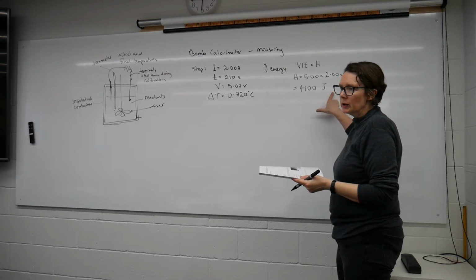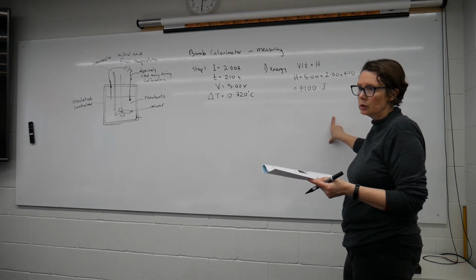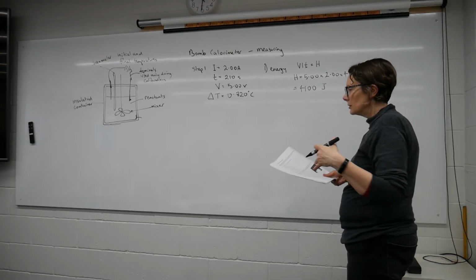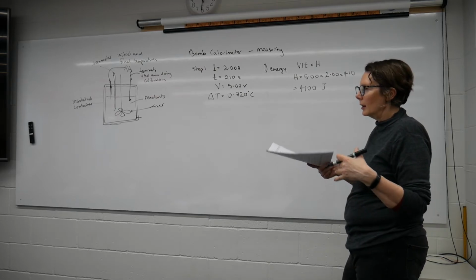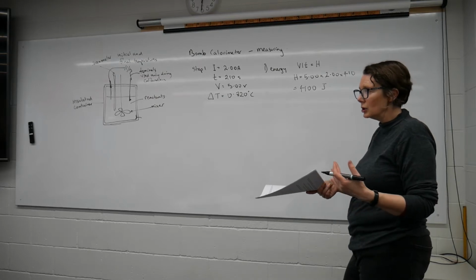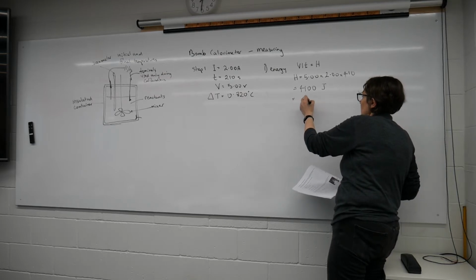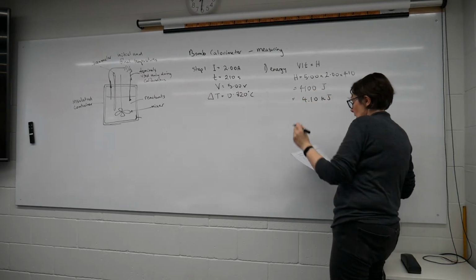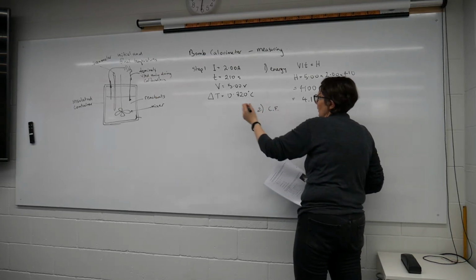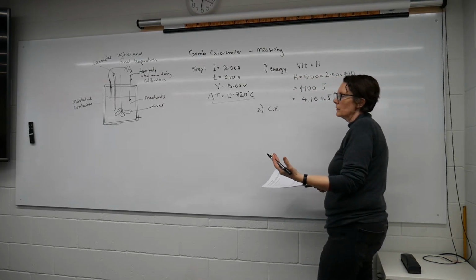The SI unit for energy is joules, but we calculate mostly in kilojoules. So what we might do here is, because our calibration factor or our specific heat capacity or our energy is often quoted in kilojoules, we'll convert it straight to kilojoules. And now the calibration factor involves this change of temperature that occurred during the calibration phase.